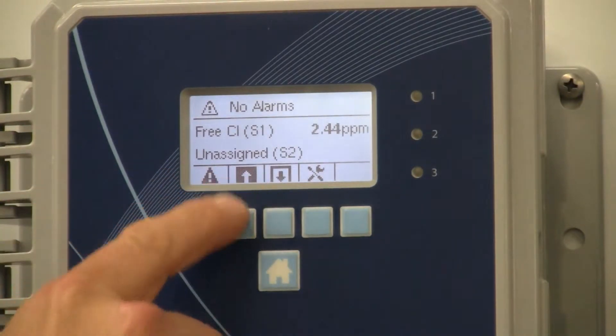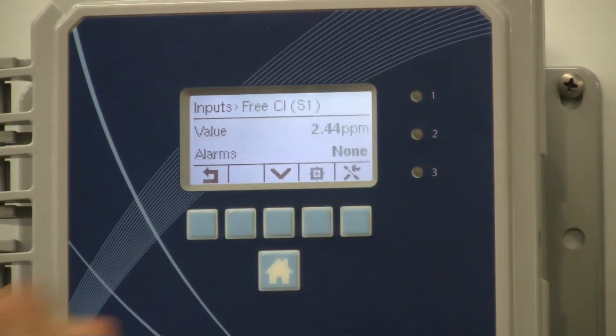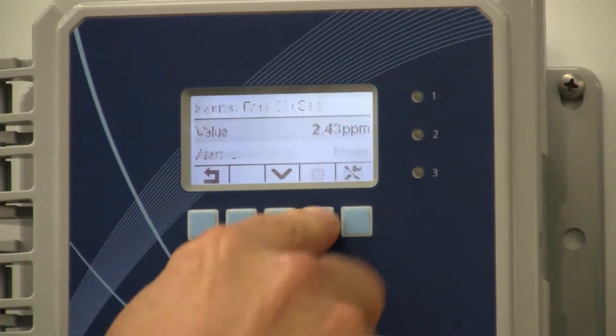You hit inputs, input, select the first one — free chlorine — enter. Then you want to calibrate; you hit this button here, that calibrate symbol, calibrate.